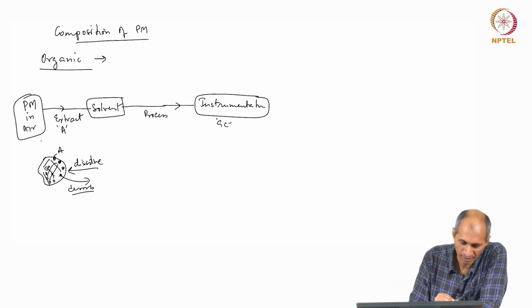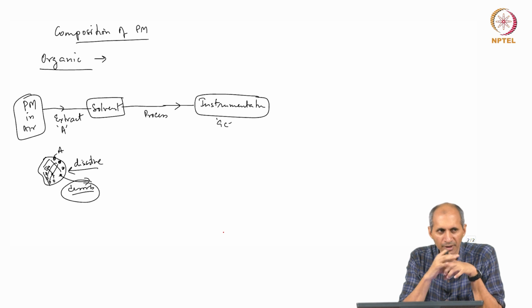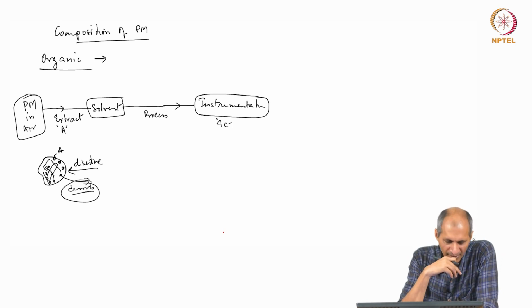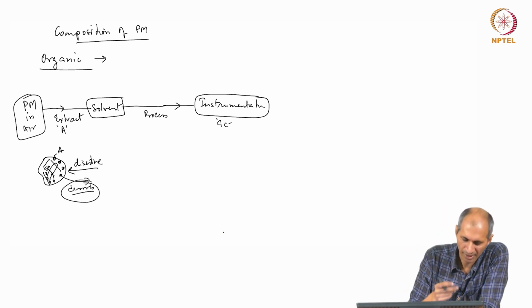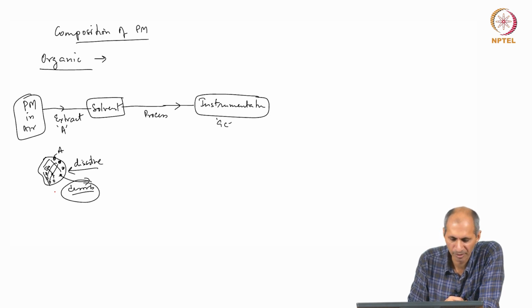and all that. So, typically it is mostly this category for carbons, compounds which are organic compounds which are adsorbed on something, or they have a composition, and not just elemental carbon. Elemental carbon will not dissolve in many of these things, it will stay as elemental carbon. So, here again there is a distinction. If you want to look at composition of some of these things, if they are adsorbed on something else, they will nicely show up in something like the GC or the LC. But if it is pure carbon, it may not show up in this, because it will not dissolve in anything, it will sit there and it is elemental, it is a solid particle by itself, pure carbon. So, for that you need to have a different approach of measuring it. So, there are tools for doing it that are different.